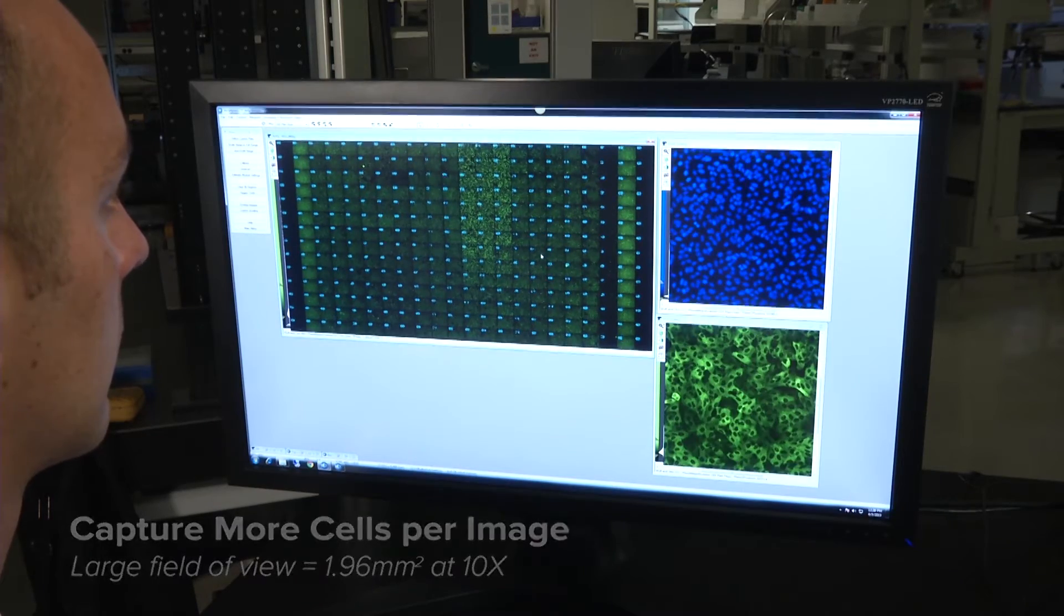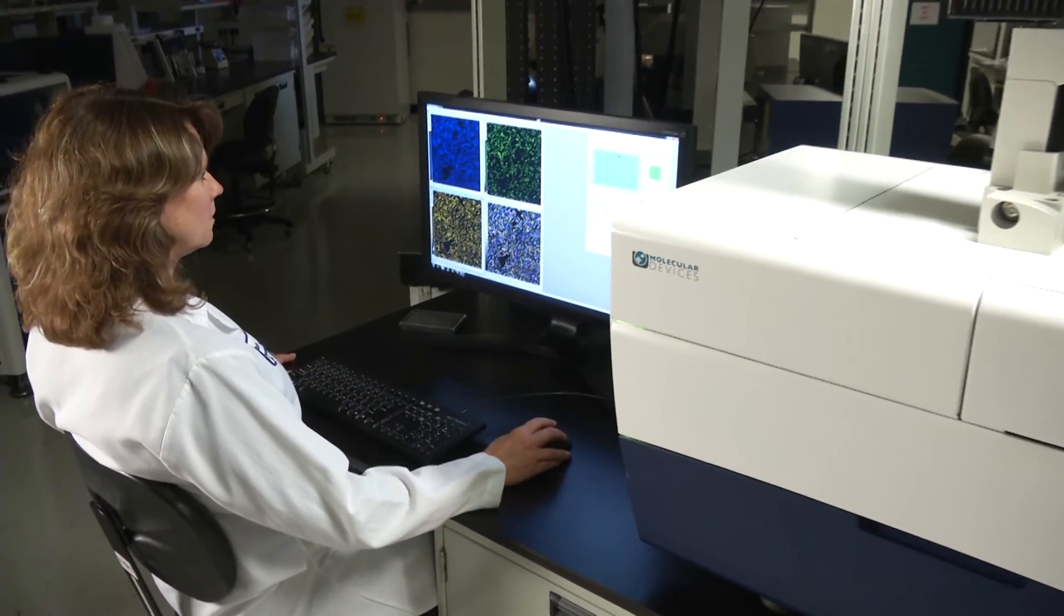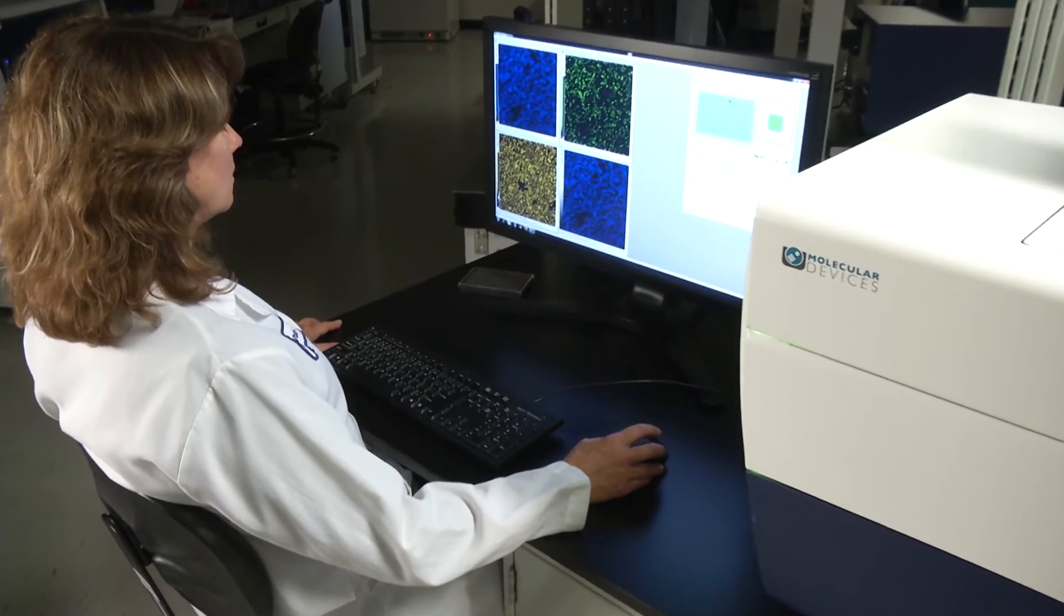The ImageExpress Micro-Confocal System is a perfect fit for any lab because it offers a mode that's right for research or screening.